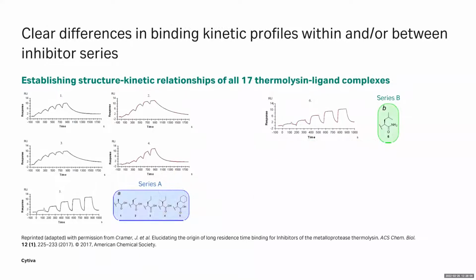So with that assay format in mind, here we are looking at kinetic rate constants and sensorgram binding profiles. We're doing dose response curves in one sensorgram, proceeding from low to high concentration. And just by visual inspection, you can see there are binders that interact relatively quickly and dissociate relatively quickly. There are binders that might interact more slowly, but also dissociate more slowly, and interactors that are intermediate.